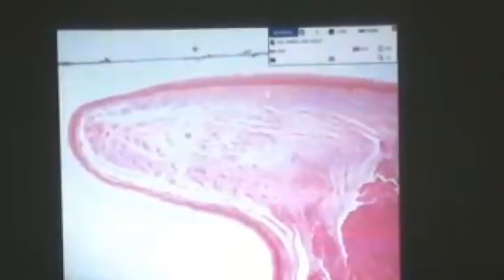Supposedly, after the nose follows the nasopharynx. If there are no slides for the nasopharynx, we will proceed immediately to the larynx. What is the function of the larynx? Passage of air and then phonation or production of sounds. Now, you will be able to identify the larynx because of the presence of those skeletal muscles. And aside from that, the larynx is composed of two projections. That is one projection, and that is the other projection.